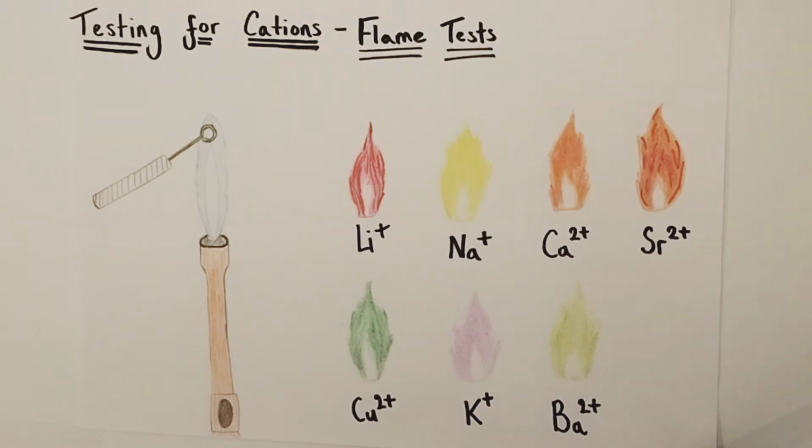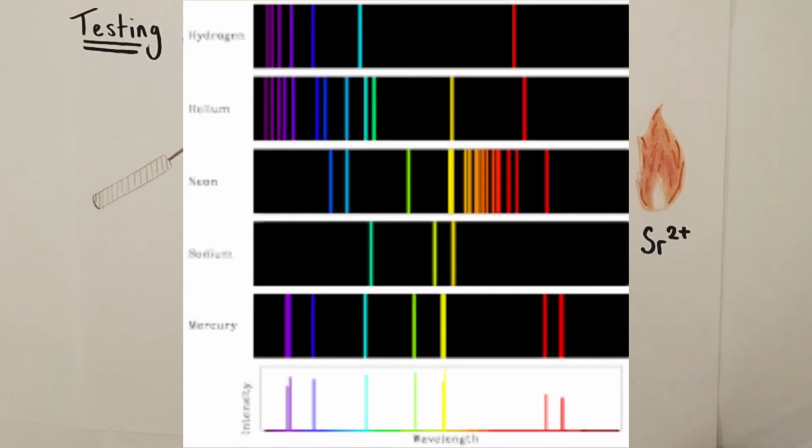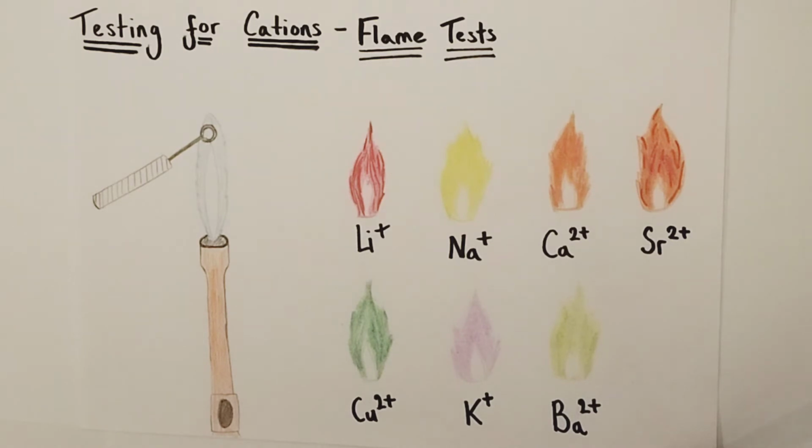So each of the various ions shown on this page has a unique emission spectrum. They all emit a unique pattern of various different wavelengths of light, and therefore various different coloured photons of light will be emitted from the heated ionic compound samples. The culmination of all those various wavelengths of light usually produces a single distinctive and prominent colour for that particular metal ion when it undergoes this flame test experiment. And that's the colour we observe, and that's the colour we're looking for.